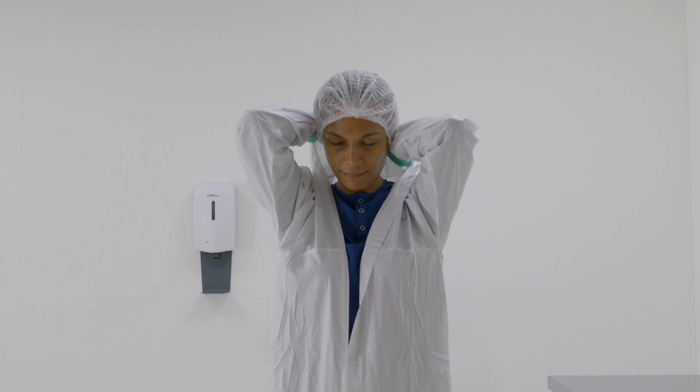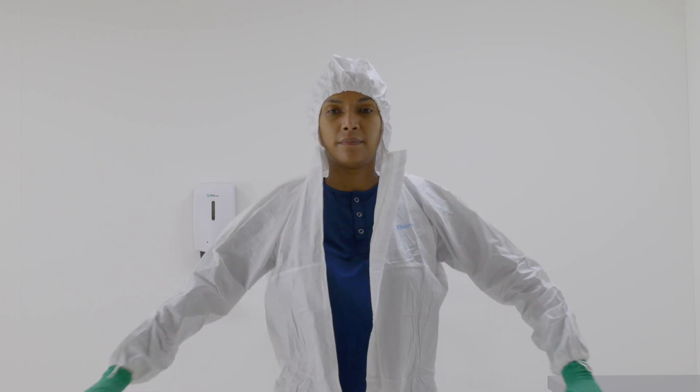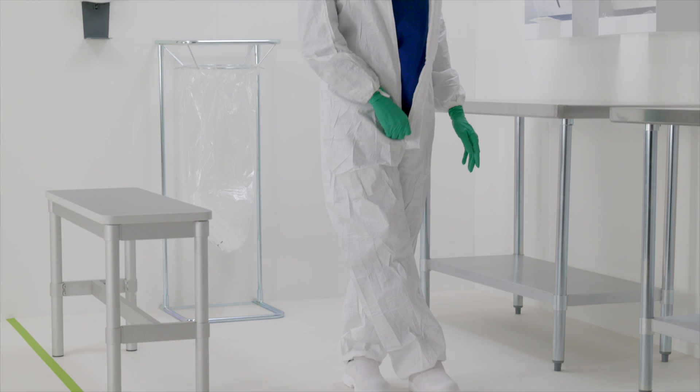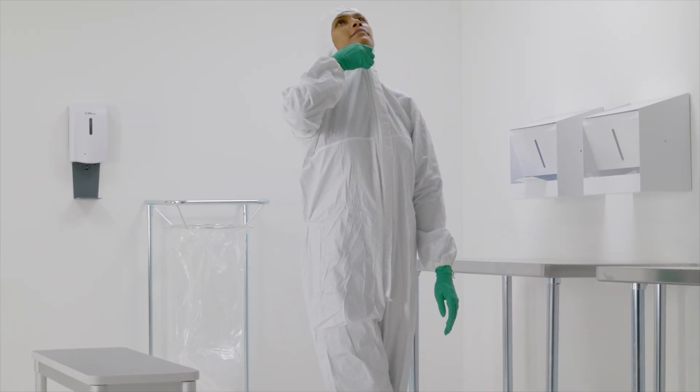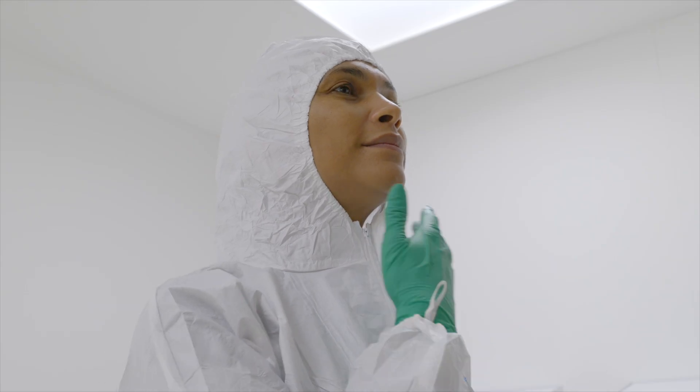Hold the hood over the head to make sure it covers over the hairline. Cross your legs and zip up the coverall fully. Remove the backing liner and stick the flap over the zipper.